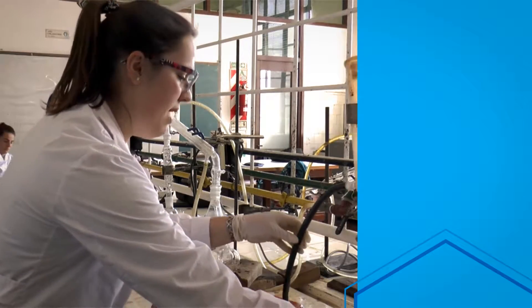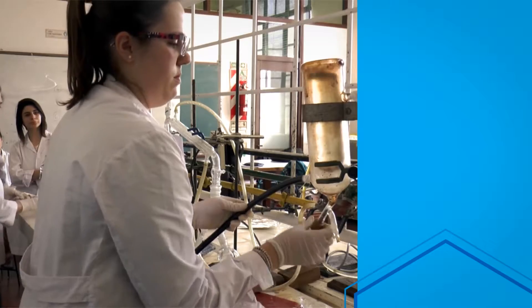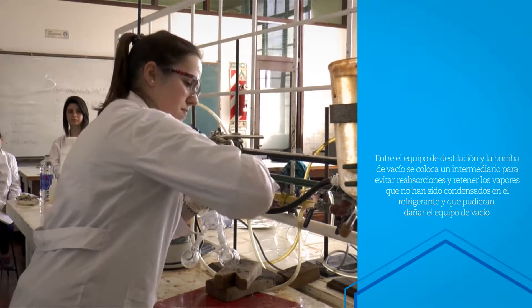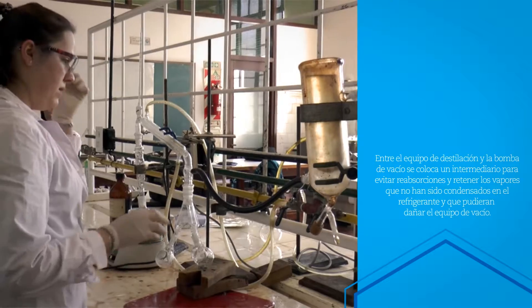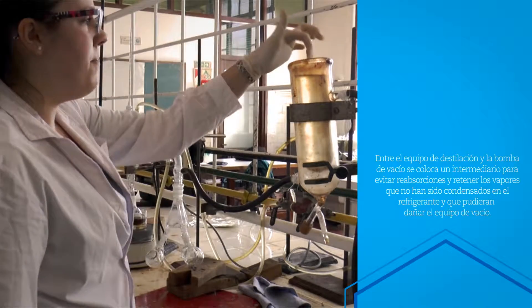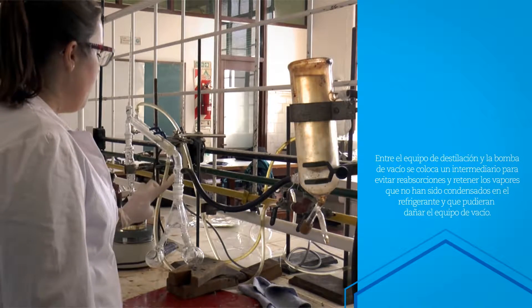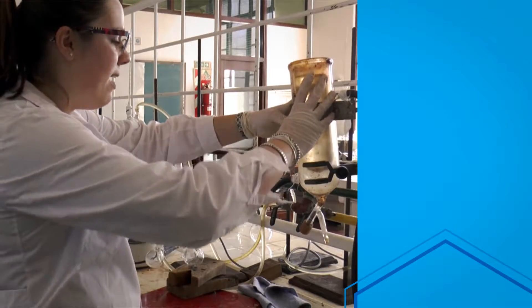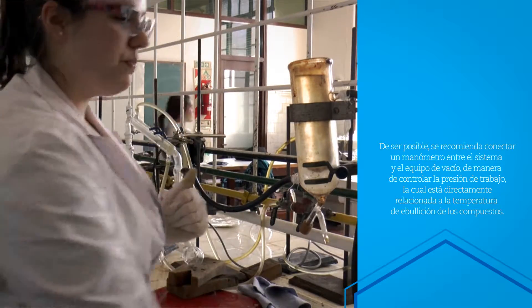Acá vamos a tener el intermediario para proteger a la bomba. Conectamos la manguera acá. Prendimos el agua. El intermediario tiene agua — se le puede poner también hielo — para que cualquier gas que no haya condensado bien y se quiera escapar hacia la bomba, el agua con hielo lo termine de condensar y caiga acá. Así no pasa nada a la bomba y la protegemos.